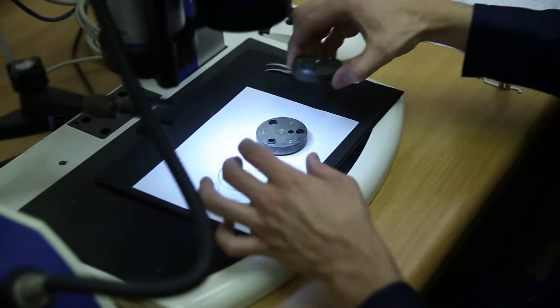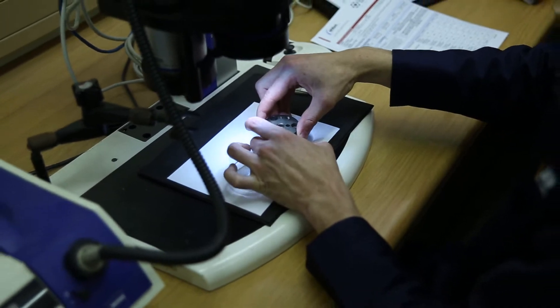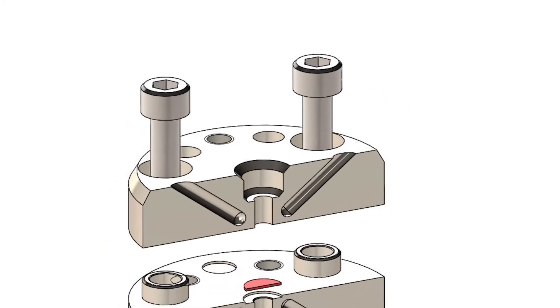This equipment is designed for measurement of the sample's creep properties, essential for safely estimating the residual life of a plant in a wide range of industries including power generation and petrochemicals.